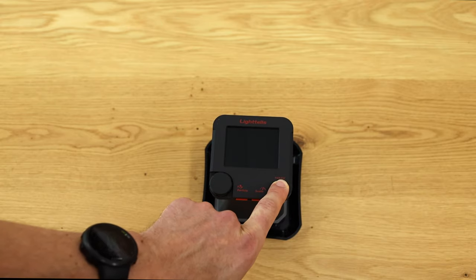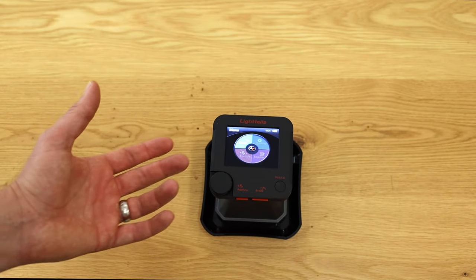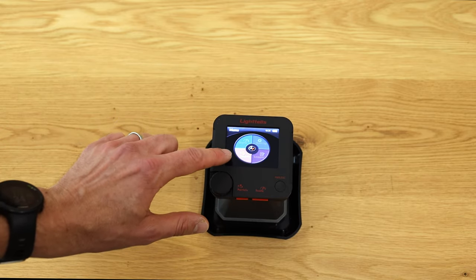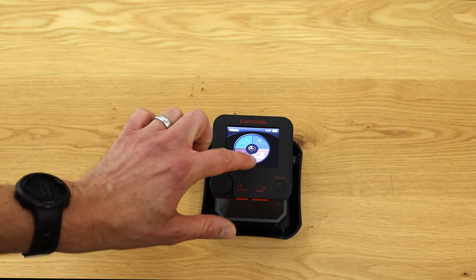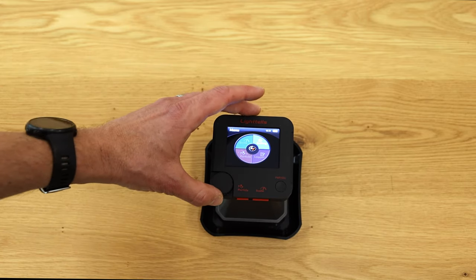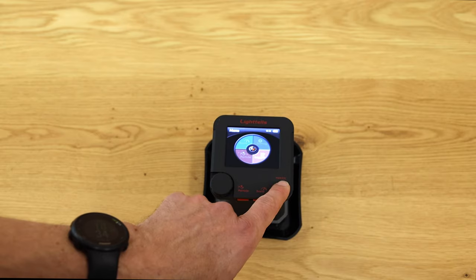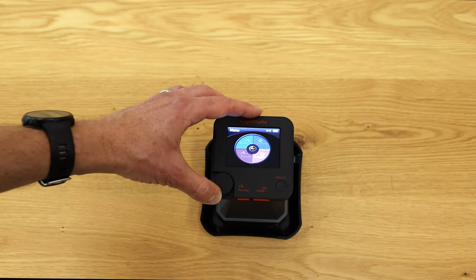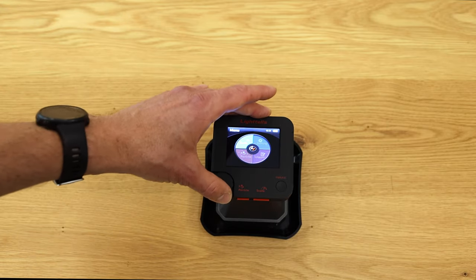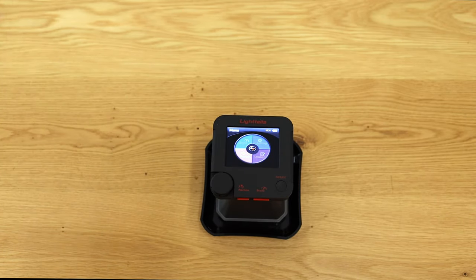Now I'll show you how the device works. I press this little button to turn on the Lighttells CM-200, which brings me into the menu. There are four options: Scale for color metering, Particle for particle size measurement, Logger where past measurements are saved, and Settings. Navigation is done with a knob you turn and press as an enter button, plus an escape/power button. You can select Scale or Particle from the menu, or use the little orange button for quicker access.